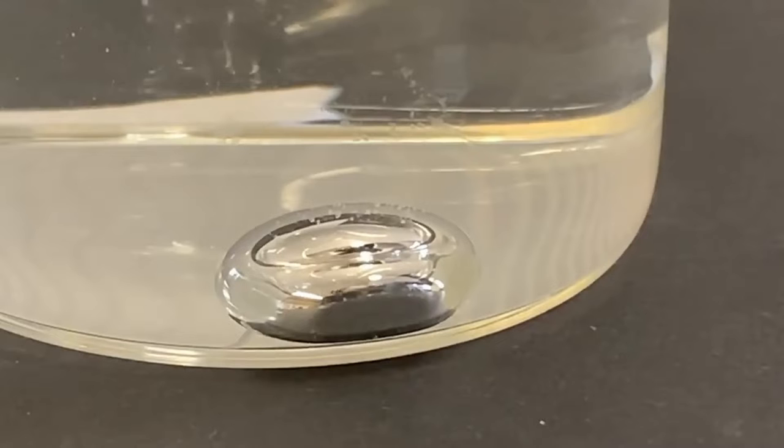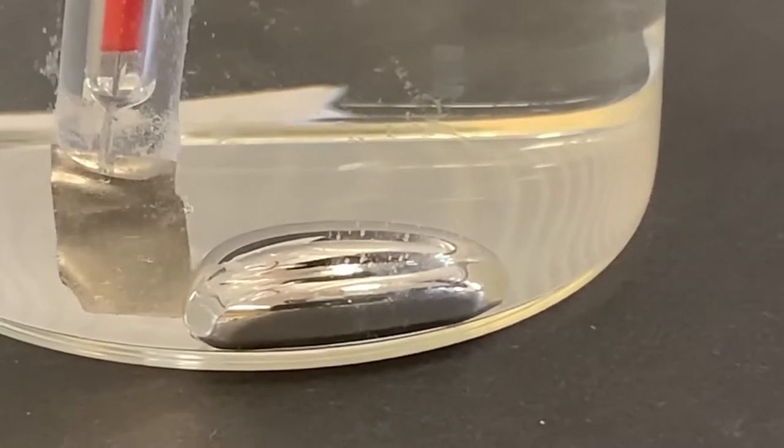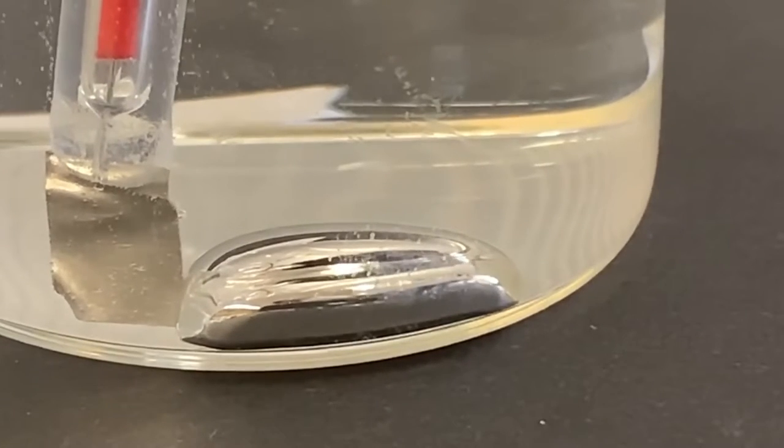First, watch what happens when I touch the droplet with a piece of metal. The droplet flattens out and bubbles form on the metal surface.